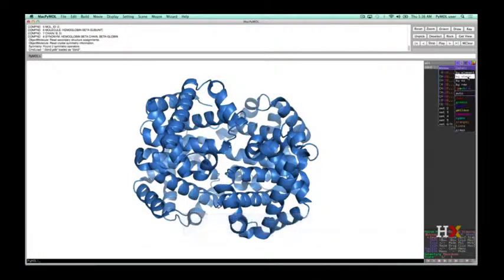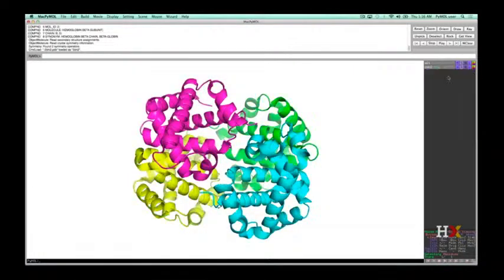Or we can color by chain, which is another way, besides labels, to see that hemoglobin has 4 polypeptide chains. Note that there are a few options: recoloring all carbons, just the C-alpha carbons, or all atoms. You can explore them on your own later.